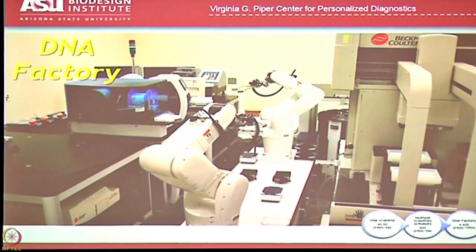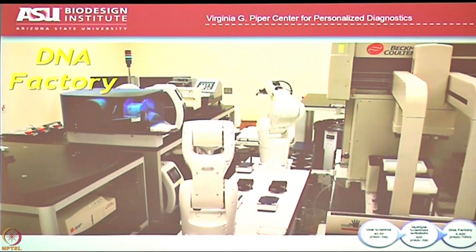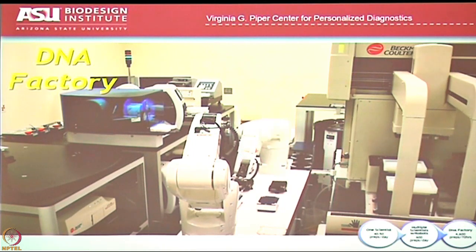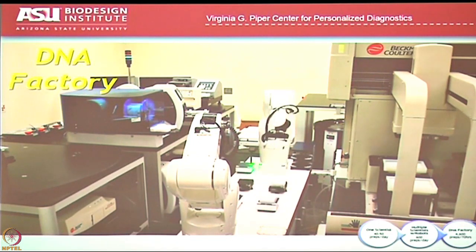And let me see if I can make this go. Is that going? Yeah. So this is what we have in Arizona now. In the basement where my lab is located, this is a fully automated platform for growing DNA and purifying it. The camera is sitting on an incubator shaker that grows the bacteria with the DNA in it. This particular shaker has a specialized door in the back so that these robot arms here can reach in and take out each one at a time as it needs to, and they pass it back and forth on that platform there.